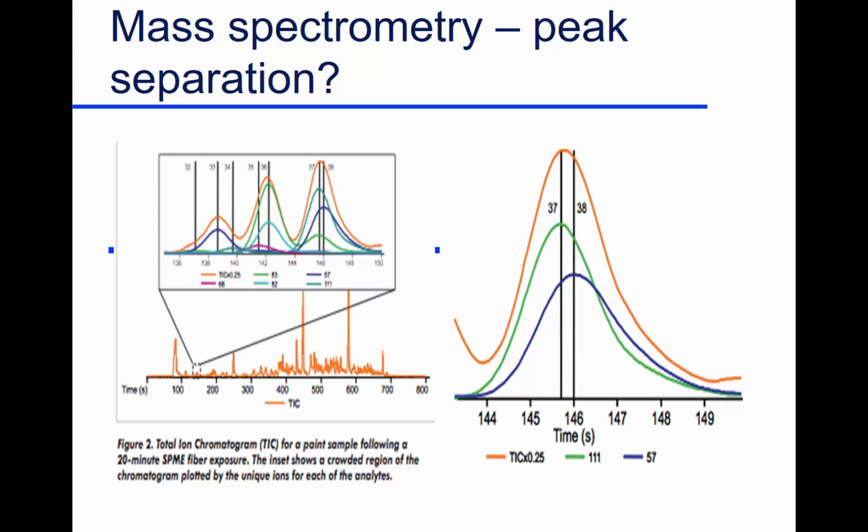This is one little segment of this. There's a little bit of peaks down here. Even if you're close, they're small. And if you enlarge that, then this orange one is what you see. You see it drawn, and you don't see any of these other colors in here, and I'll explain what the other colors are. With flame ionization, you'd see this peak come up and you'd say, oh, that's one compound, right? Oh, it's one peak. Gosh, it looks nice and symmetrical.